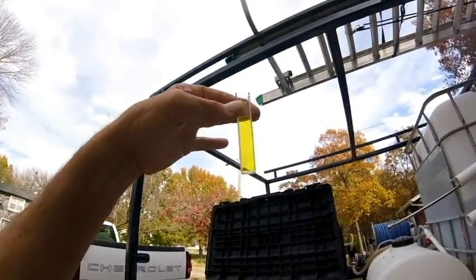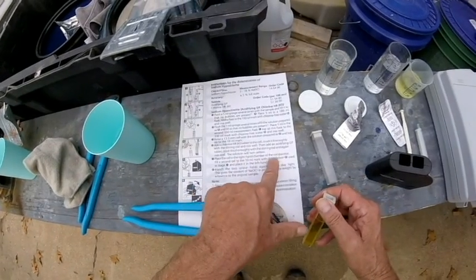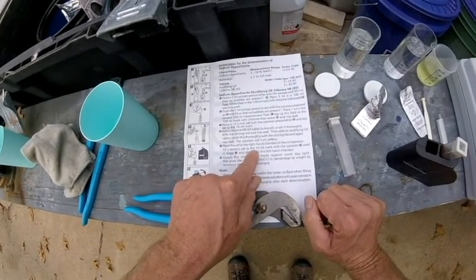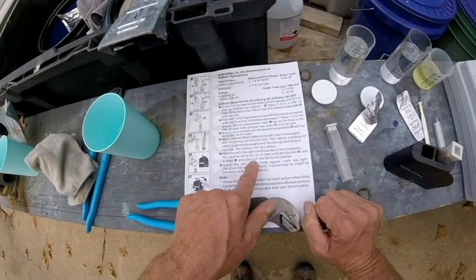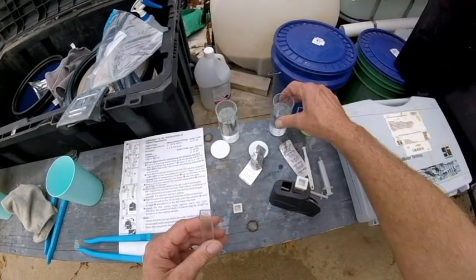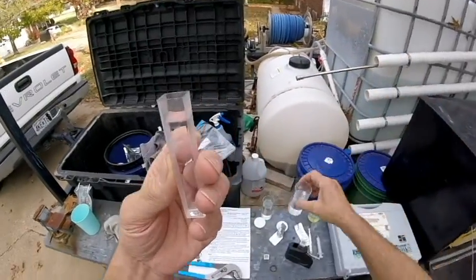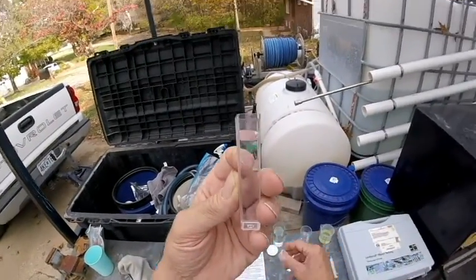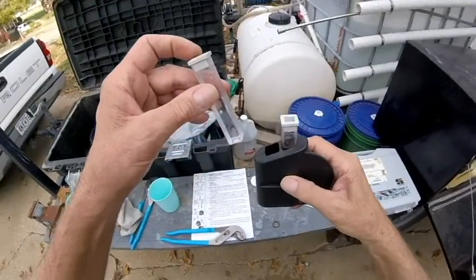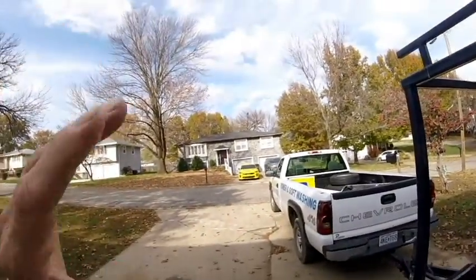Now we're nice and yellow. It says to place this cell in the right-hand chamber of the comparator — we'll do that on the right-hand side. Fill the second cell to the 10mL mark with the solution used in stage three and place it in the left chamber. That would be our first dilution. This second cell is as clear as can be — this is the part where I'm like, why are they even doing that? Then it says to match the two color fields against north daylight — they just don't want you to do it in direct sunlight.